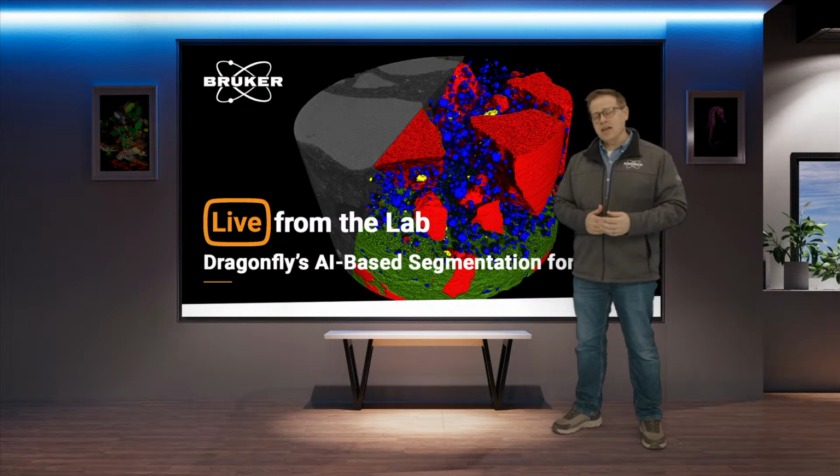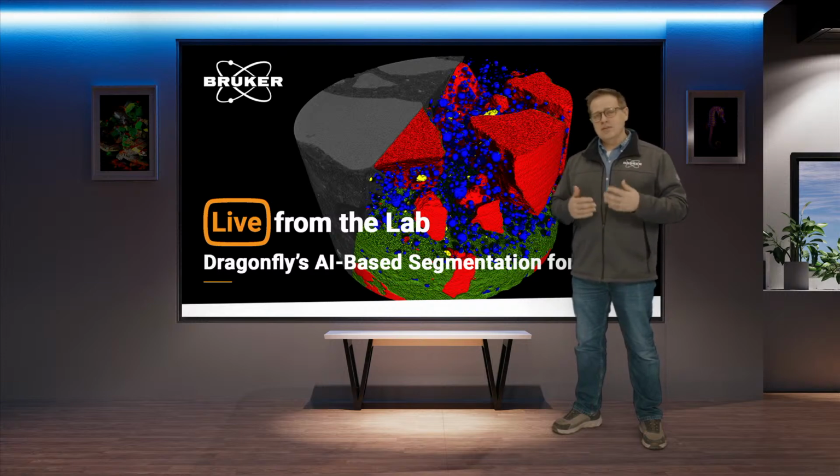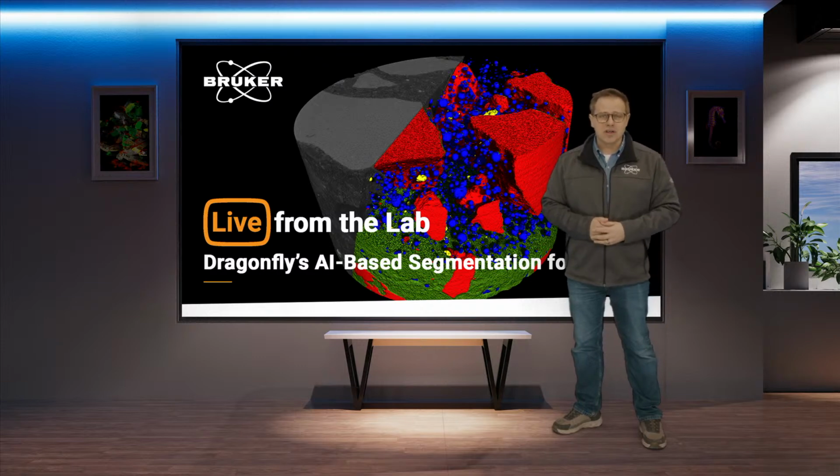Now, this is a package that can be used for looking at X-ray microscope data in order to gain some additional insights into both the qualitative and the quantitative nature of what's going on in your samples. It's a great supplement to our included software package with CTAn and also CTVox and that whole package. But today we're diving deeper into this particular software, and we'll hear a lot about that. So on that note, let's head on over and start that discussion.